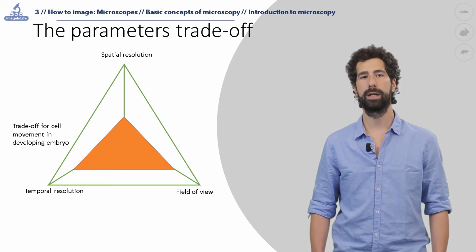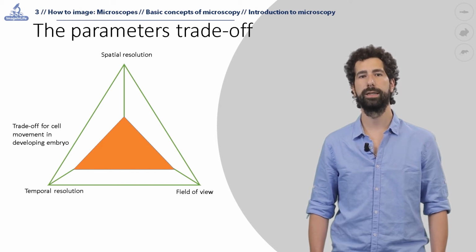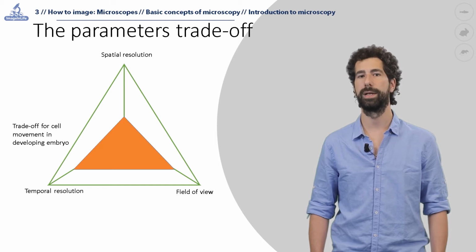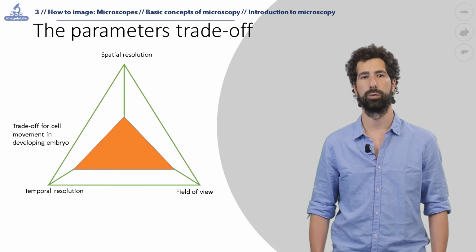Also, a common mistake by non-expert users is to think that the more we magnify the image, the more we will be able to resolve the smallest feature of our specimen. This is not true, as while the magnification can be easily increased by sacrificing the field of view, there are physical limitations to the spatial resolution.